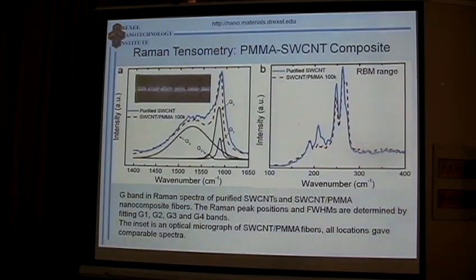But if I'm not mistaken, when you heat your samples, the shift could be not only due to the strain or stress, it could be due to phonon-phonon interactions and, for example, expansion of volume or something. Sure. No, but I mean not the strength here. Basically, what you have is elongation of the bond when you heat it here. So it's kind of similar to applying tensile stress. So usually this is because of this.